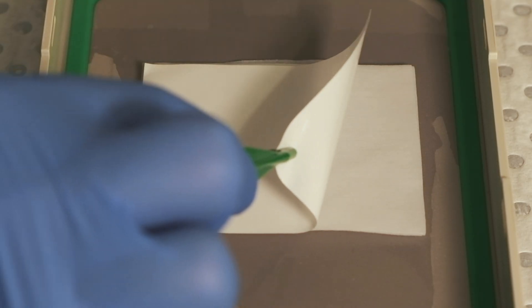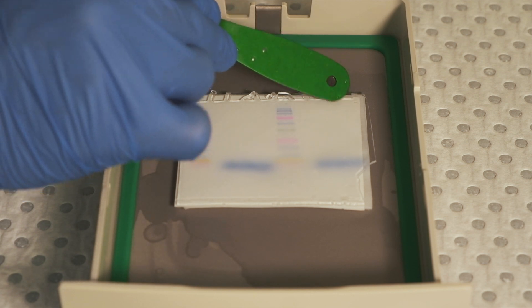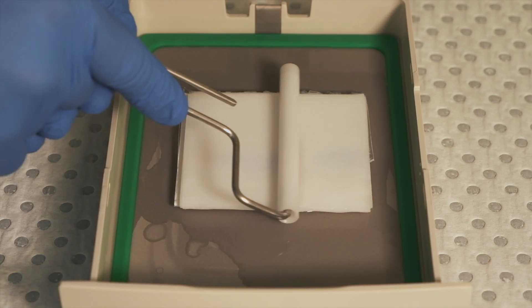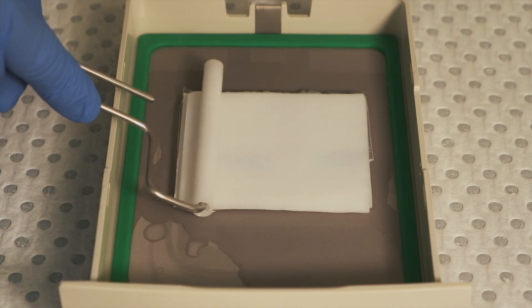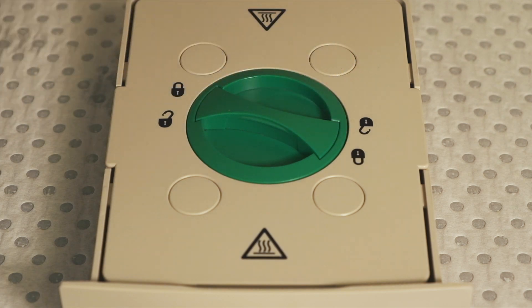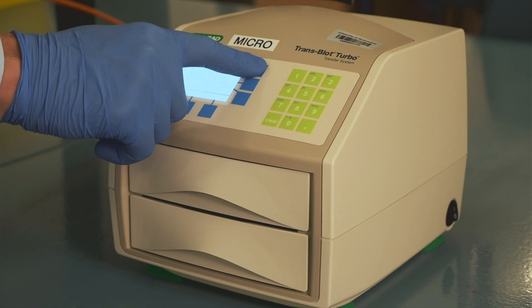Let's look at this process in practice. We begin by sandwiching the gel and the membrane between layers of absorbent materials which have been moisturised in buffer. A roller is used once the materials are all in place to push out any air bubbles which may be trapped between the layers. The tray containing the gel and membrane is then placed into a semi-dry blotter which applies a current through the gel and membrane, effectively mirror-transferring the proteins from the gel onto the membrane.